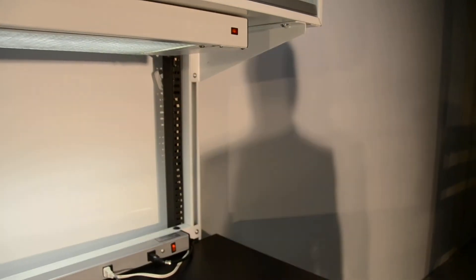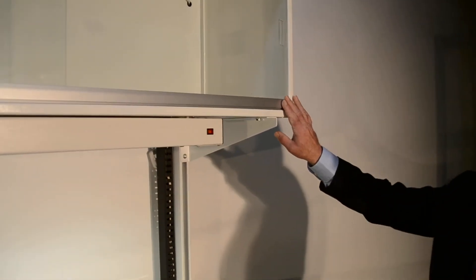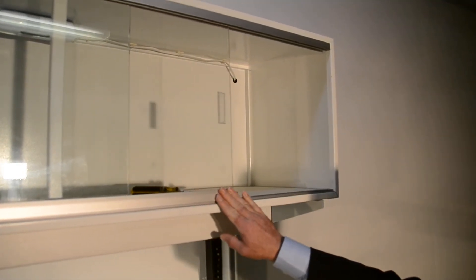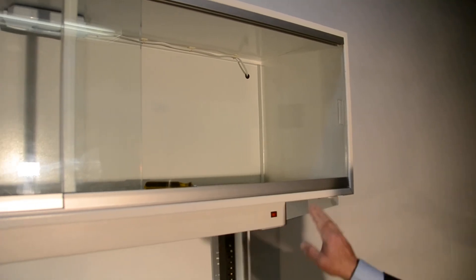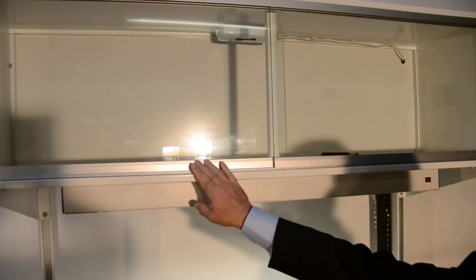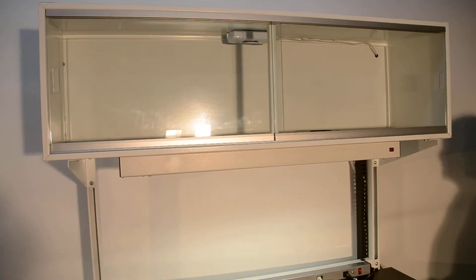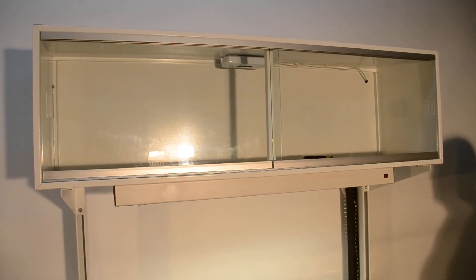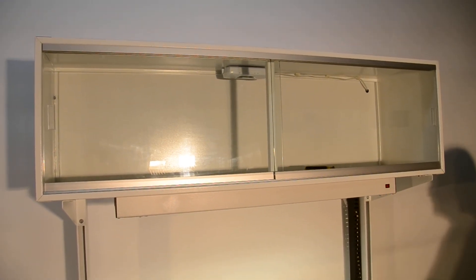And we also have a sliding door cabinet. This is showing the glass doors. It's on an aluminum track with roller bearing glides. Very smooth operation. It is a tempered safety glass so you don't have to worry about someone accidentally hitting that, breaking that and getting hurt.